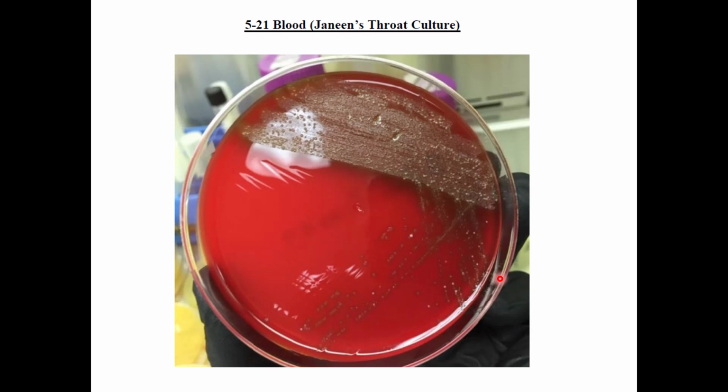But the example that we have here is our lab technician's throat culture. Okay, and in this example, we are not looking against the light, so we can't tell for sure what pattern of hemolysis we would get. But it is important to also look without being against the light, just to see the different colonies. Okay, so we can see some white colonies over here, and we can see even some greenish color, even though it's not completely against the light. We can still see a different color. Whatever this color is, it's not the same as this one in white.